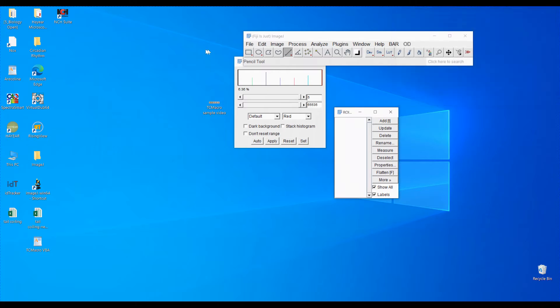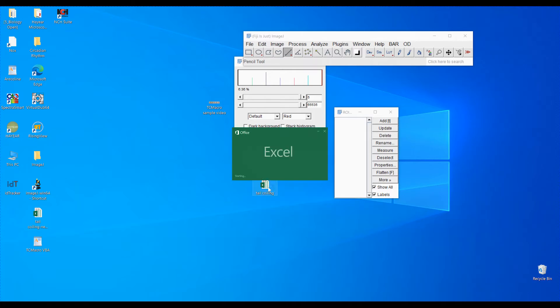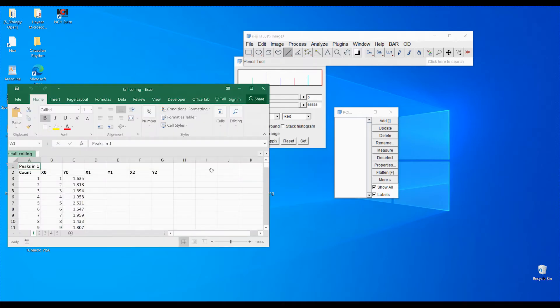You will now have a new file named 'tailcoiling.' You can use this file to continue with the Excel VBA process, or go straight to statistical analysis if you only need the tail coiling occurrence.